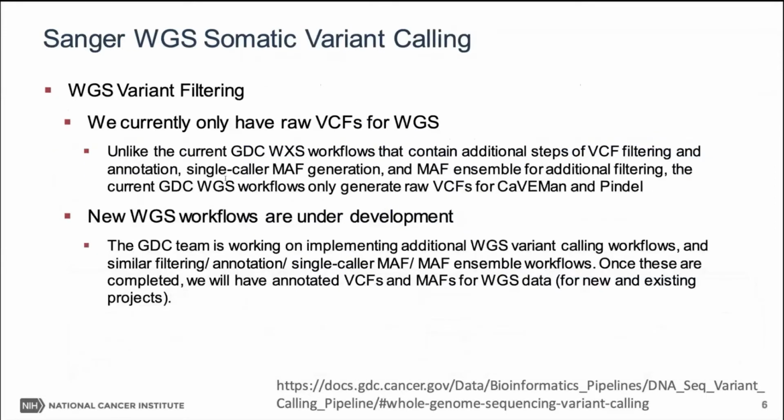After this is done, and we expect the workflow on the current schedule to be complete by the end of this summer, we'll roll out a production phase and gradually release these whole genome MAFs in the portal. And I think we should expect those whole genome MAFs to be available from the beginning of next year through different projects, probably one by one, because they need a lot of computation.